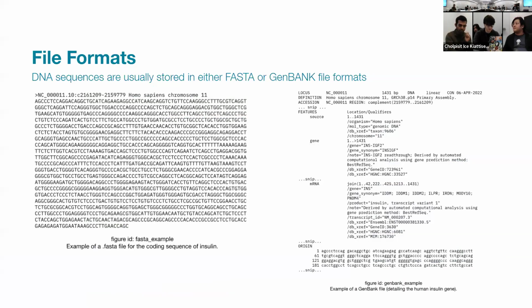The reason that we have to use Benchling is because if you take the DNA, most of the time you get it in this kind of form, and it's not that readable, right? If I asked you, hey, can you remember these and just keep working with them, or just open them in a notepad. Great final project question, just go memorize this. That's not actually happening, I was going to say. So if you take this, it will be in a different form.